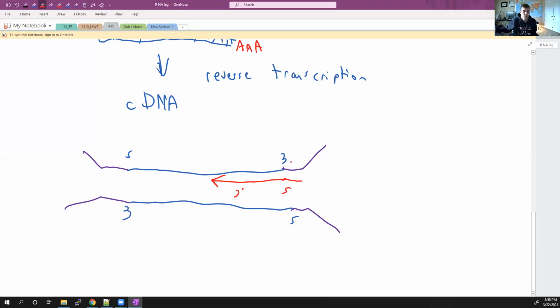When Illumina started out, they were bragging about 32 base pair reads. When they got to 100 base pair reads, that was a pretty big deal. But now they're up to 300 plus base pairs of sequencing. The data that we'll probably work with is going to be between 100 and 150 base pairs. Anyways, we're going to sequence at least this one fragment, in this orientation, 5' to 3'.